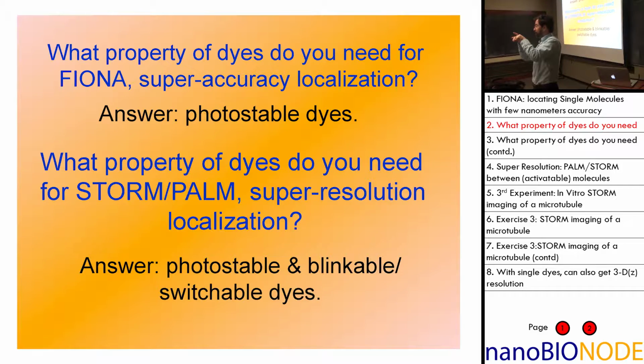So you shine 400 nanometer light on it, it goes on, then you shine some visible light, you get that to fluoresce, and then when it's finished fluorescing, namely, generally it photobleaches, then that one's off, and then you shine 400 nanometer light on it again, and this one comes on.